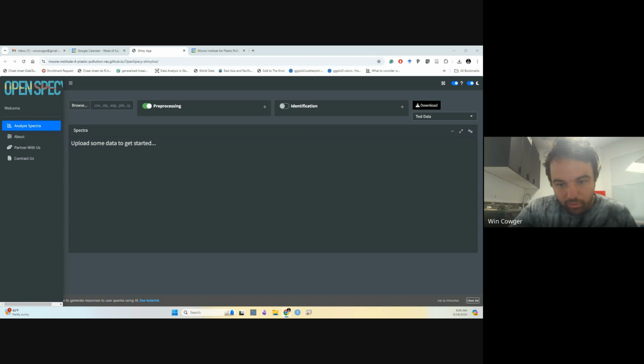Okay, it loads after 1 minute, but processing isn't working. Transforming a reflectance spectra to absorbance isn't working. Okay, well, that's good to know. So there may be some pre-processing issues going on. Thank you for letting us know about that.